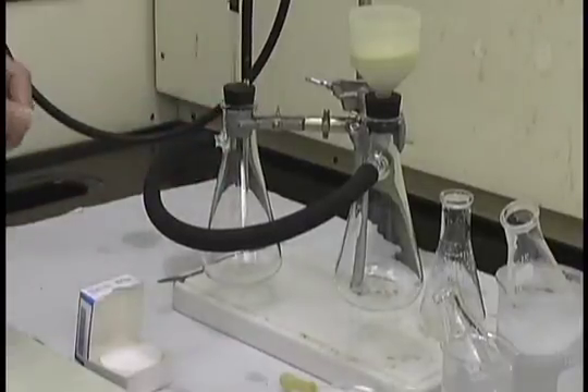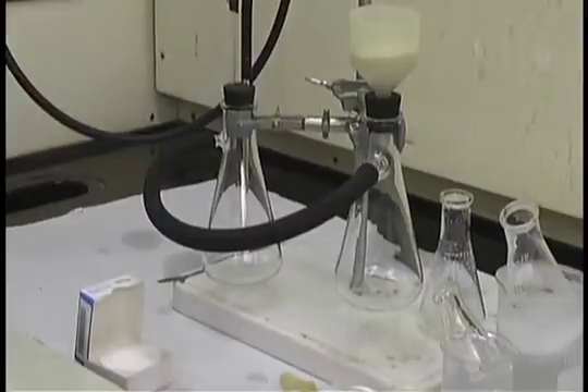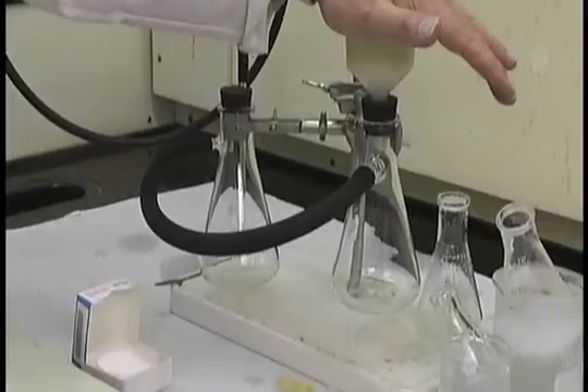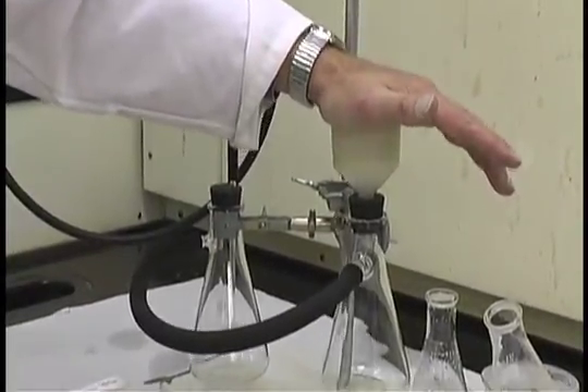To begin the filtration, we simply turn on the aspirator so that it is fully open. We need to check that there is in fact a vacuum pulling — you can see that it pulls my hand into the funnel.